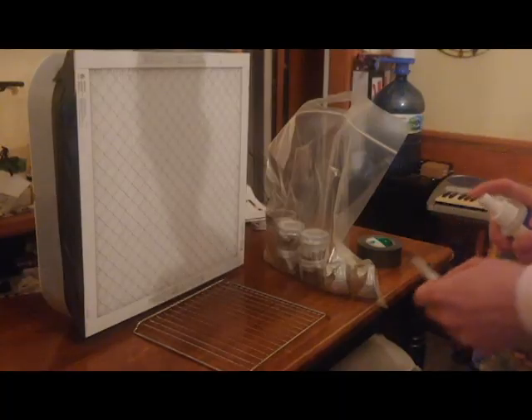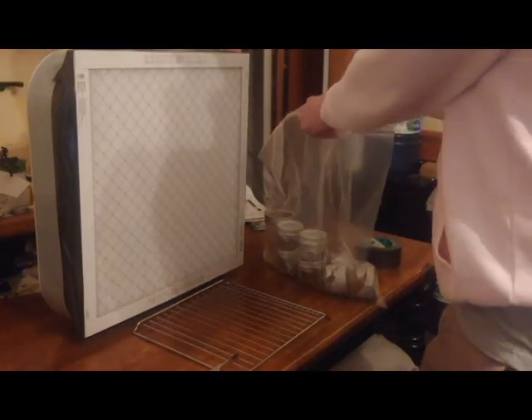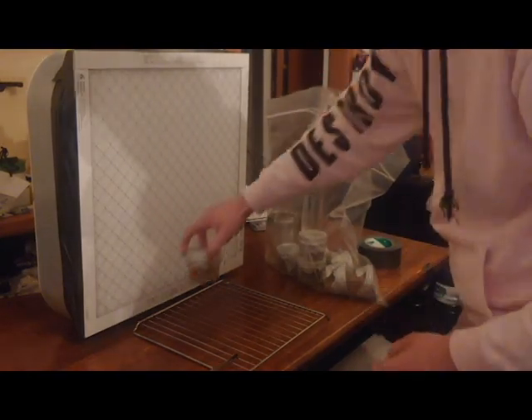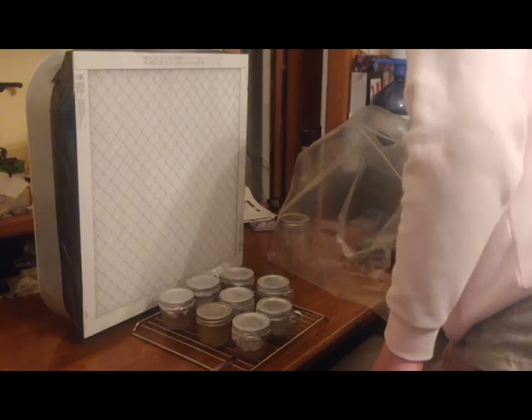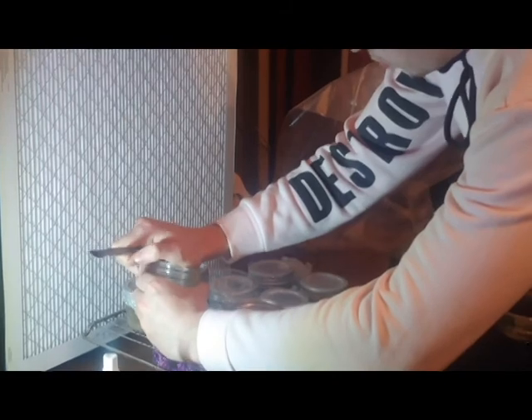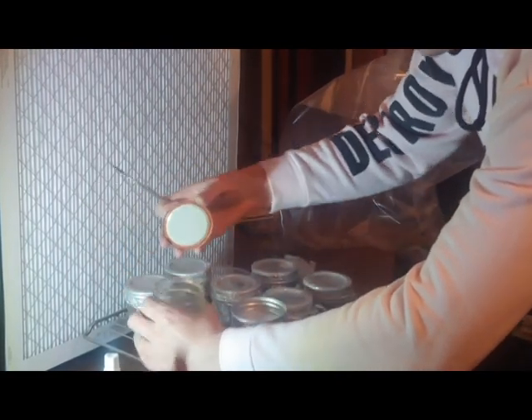A key aspect with sterilization work or any sterile work in a flow situation is using sterile practices. That means not putting anything that could be contaminated between the flow output and the agar or substrate that you're working on. A key thing is sterilizing the utensils you're using.